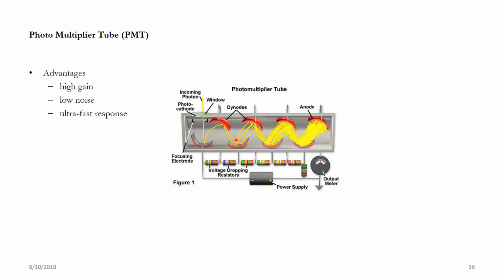You hope that, but of course not always it will happen, but if your tree is good then it is going to happen. So in the same way here it's loaded with a lot of electrons because of a lot of voltage, and then secondary electron generation will happen, and at each step it is going to be multiplied, or there's an exponential gain, and by the time it reaches the last dynode it has already multiplied a couple of hundreds and thousands of times, right? So that's how it works.